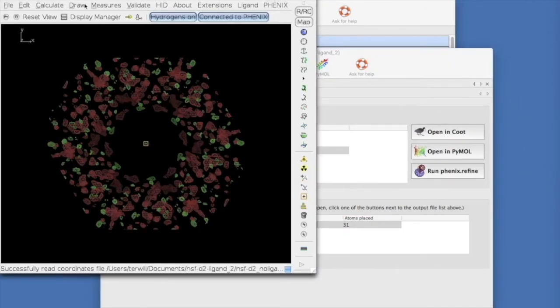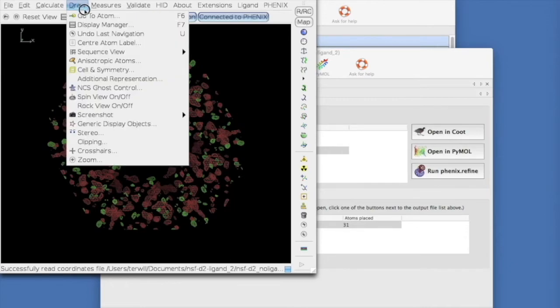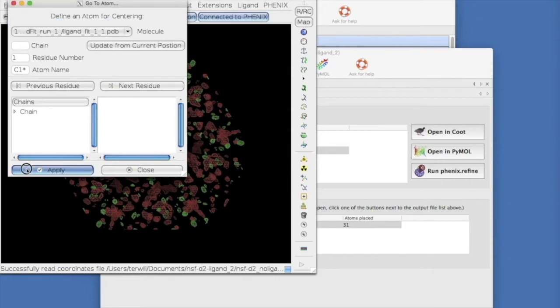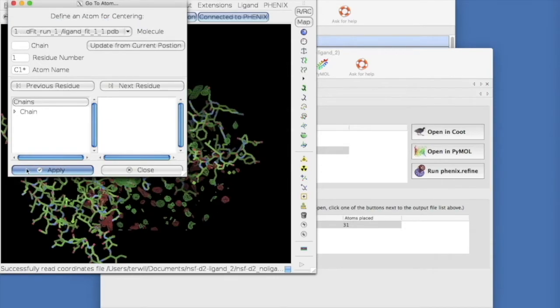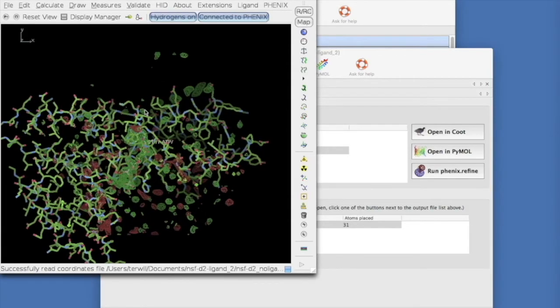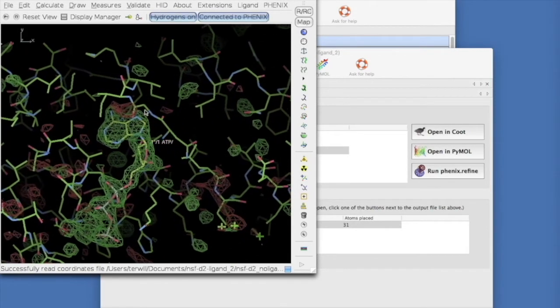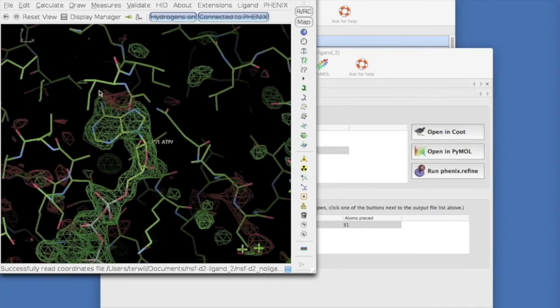We can center on the ligand with Go to Atom, selecting the Ligand Fit 1.1 PDB file, and Apply. Zooming in, we see that the ligand is placed in the density very nicely.